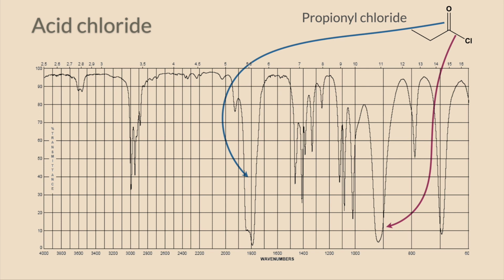And because of that, among the carbon-halogen bonds, the only one that will show in the spectra is that of chlorine. Usually the others, because they are slightly larger, will not appear in the spectra. So that's one thing to remember.